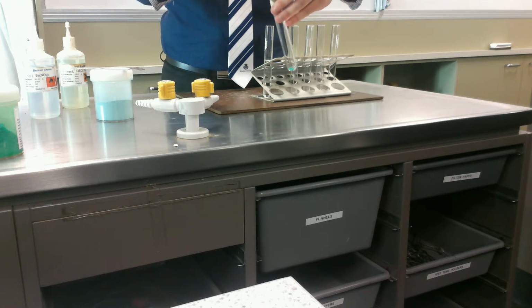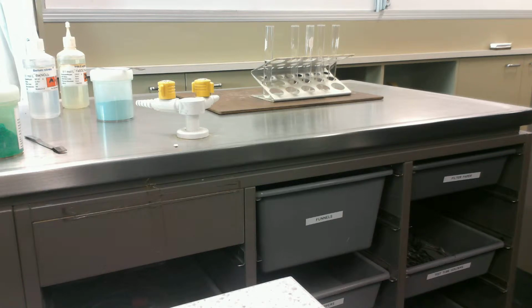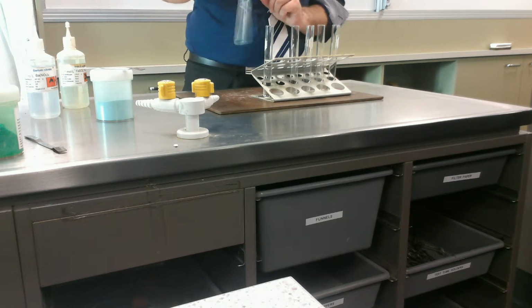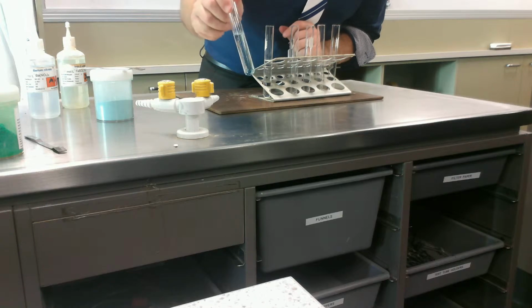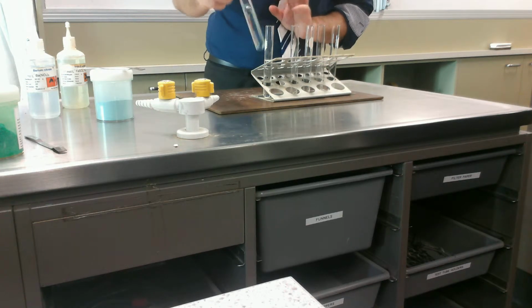Okay. Again, into my test tube. And going to use water as my solvent and see if it will dissolve. And you'll see why I didn't put so much in, because I knew it wasn't quite the same solubility. Now this is interesting. It started off green, didn't it? What colour is it now? Blue. Can you see any solid bits floating in it anymore? No. One or two maybe if you looked closely enough, but not nearly as many.